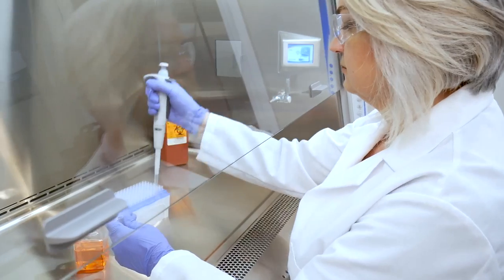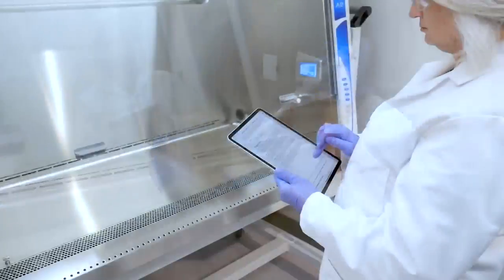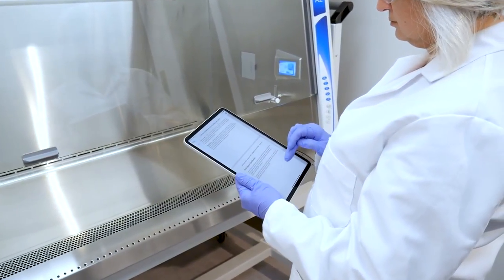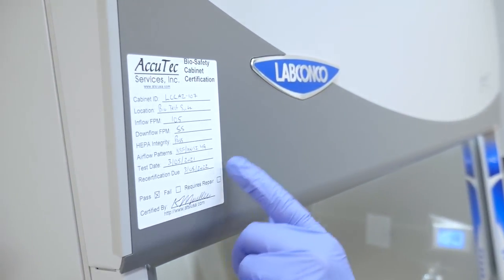This next section will cover safe operational techniques with your biosafety cabinet. Be sure to follow your organization's biosafety cabinet guidance documents if offered. First, verify that your cabinet has a current certification.